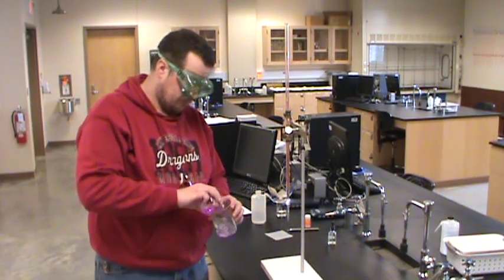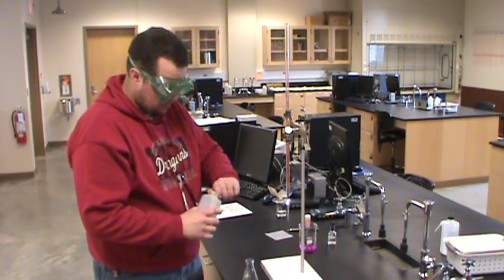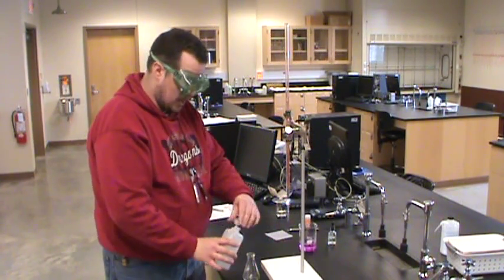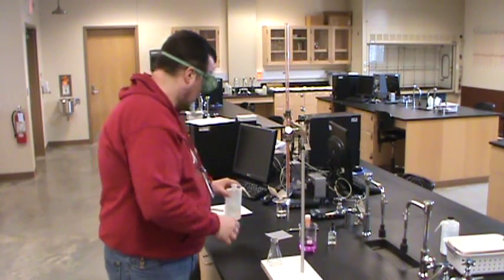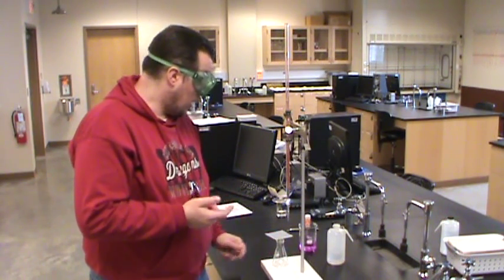So let's dump that into our waste. I can give that same Erlenmeyer flask a good rinse with deionized water. And I'm all ready to go again. I'm going to do as many titrations as I need to do to convince myself that I've got a good answer, that I've got reliable results. And that's the entire experiment for this week.